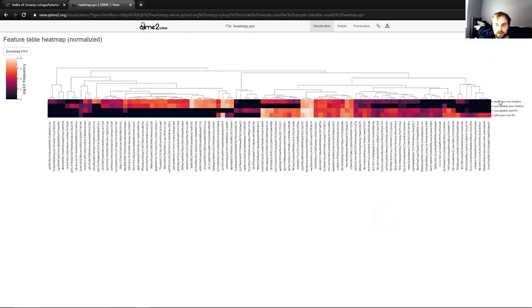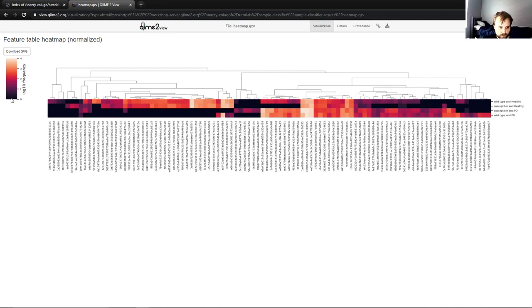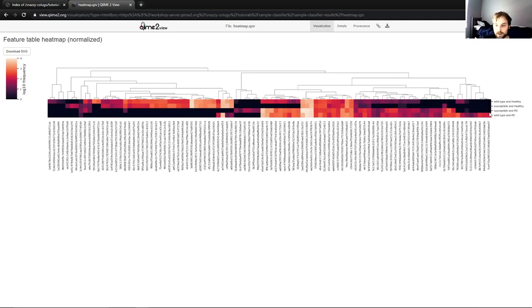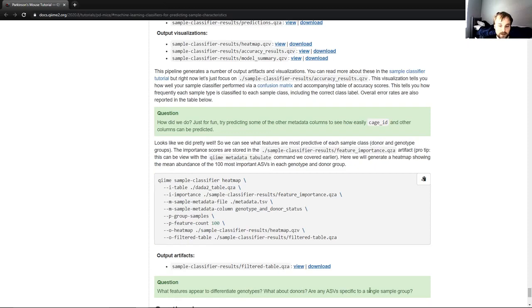So we can see we have over here wild type and healthy, susceptible and healthy, susceptible and PD, wild type and PD are different categories. And down here we have the most important features in determining these categories as taken from that file we viewed previously. And so you can see here that if those features weren't present, we'll have a black square. So for instance, this particular feature was not present in any of these three categories, but it was present in wild type and PD. And going back to our question, what features appear to differentiate genotypes? What about donors? Are any ASVs specific to a single sample group? Well, we already just answered that.